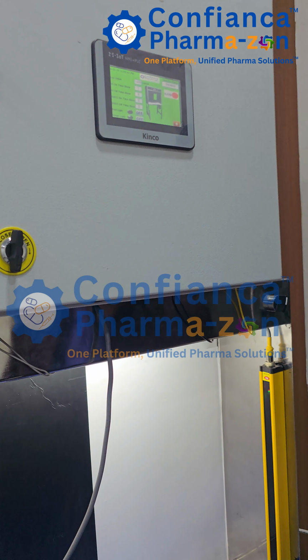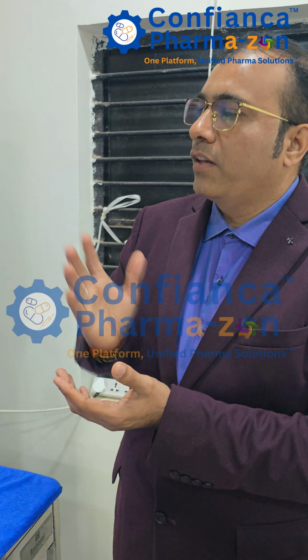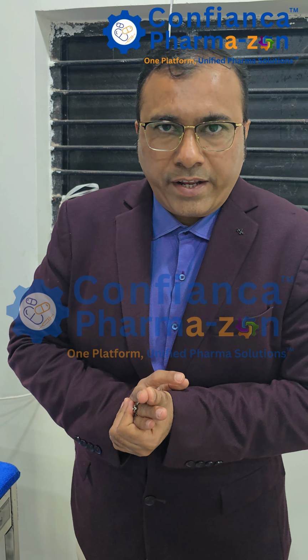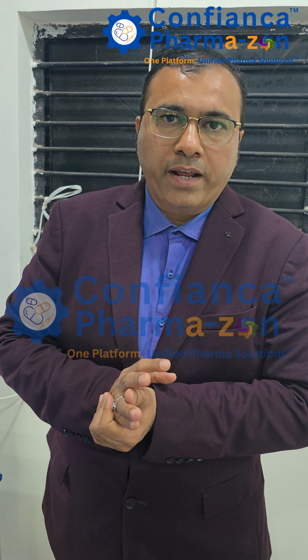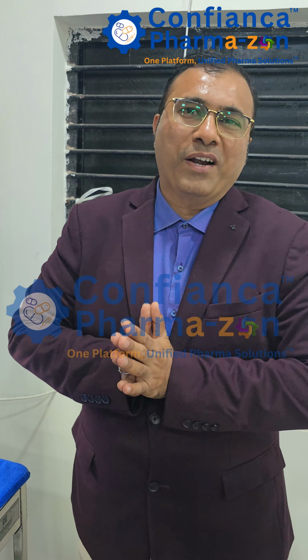This is how the entire automation works: you will have a lux value, the fatigue time, the continuing on time, and the 5-second compliance time. All of those things are part of this.